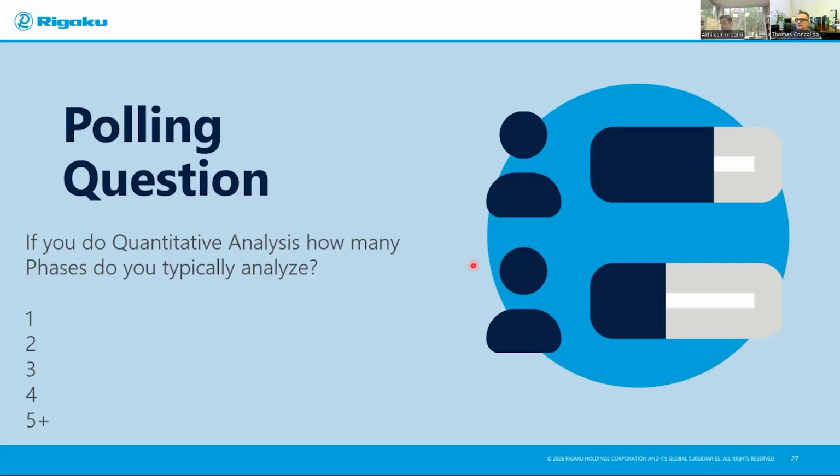Yes, very good question. Usually we handle amorphous content with an internal standard, but the caveat is that you must choose one carefully. For example, zinc oxide or corundum are two very popular ones. I'm sure you're aware of those two. Both are inorganic samples and do not change over a period of time. But I have a few caveats again. Make sure their peaks are not overlapping too much with the phases you are analyzing, because that's always a concern. So you have to choose your internal standard judiciously, one which is not overlapping too much.